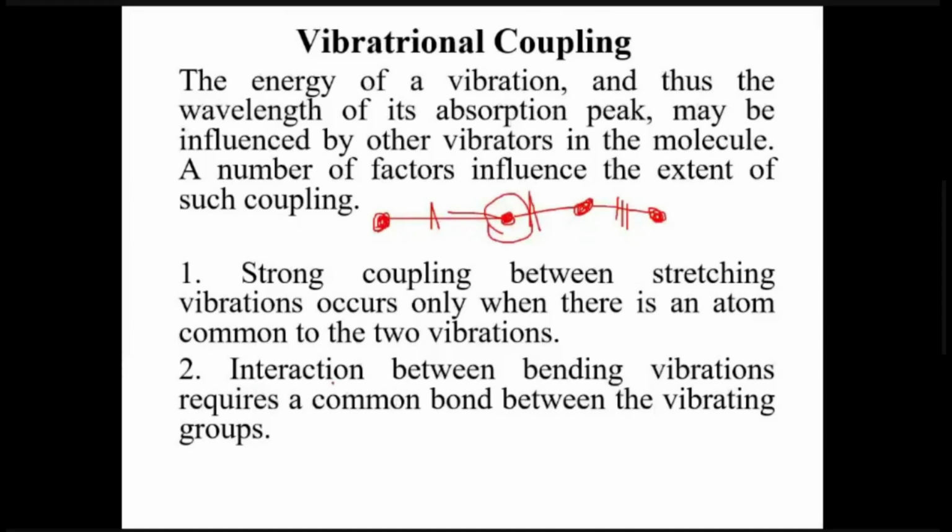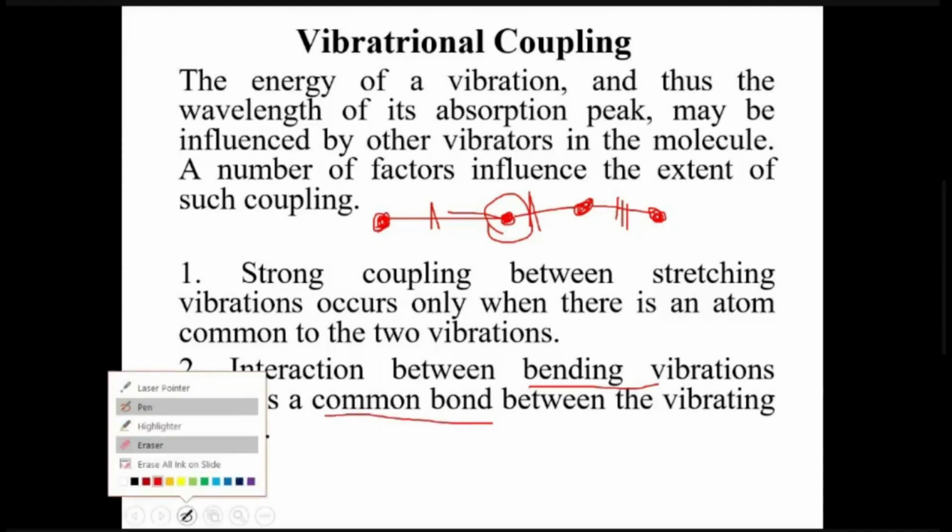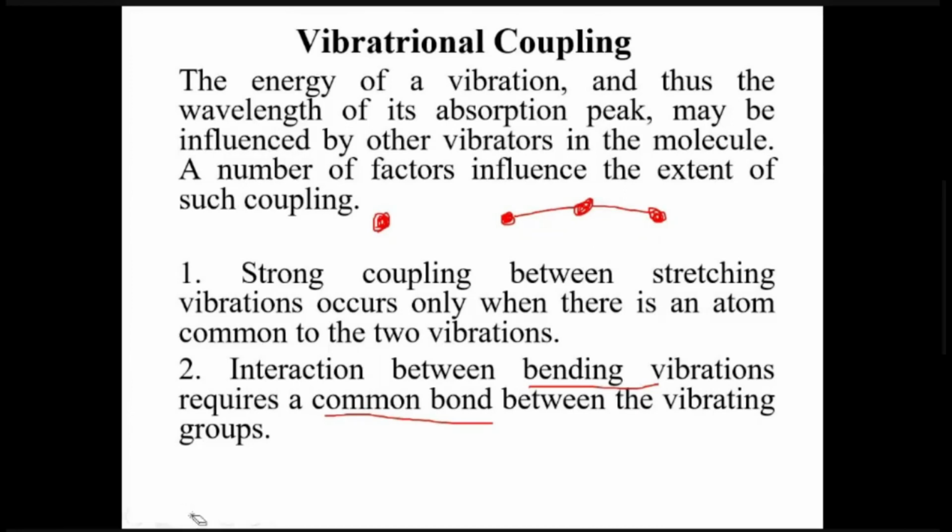Interaction between bending vibrations requires a common bond between the vibrating groups. Now, this bond angle is changing when the molecule is vibrating. This may affect the bending of this other angle because they are sharing this bond.